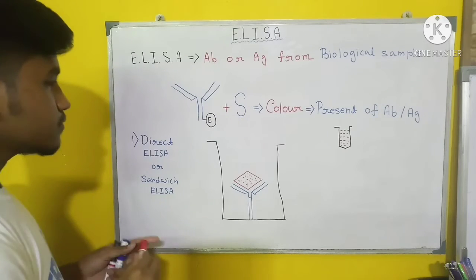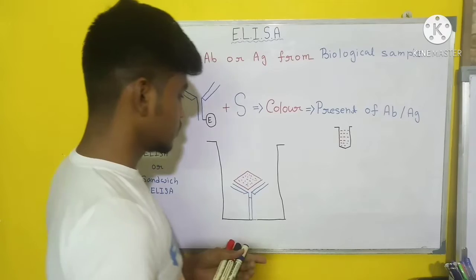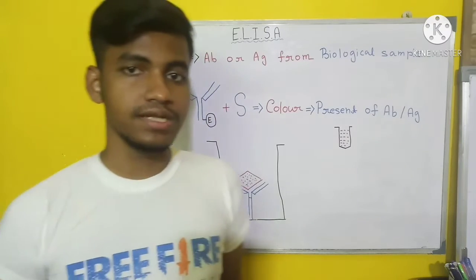After that we will incubate it at 37 degrees Celsius.